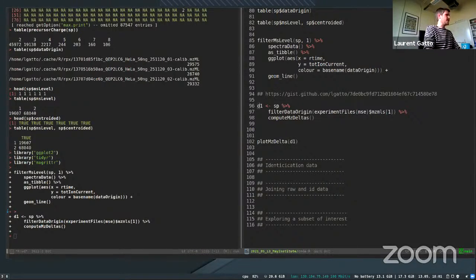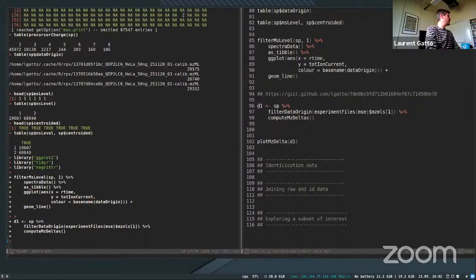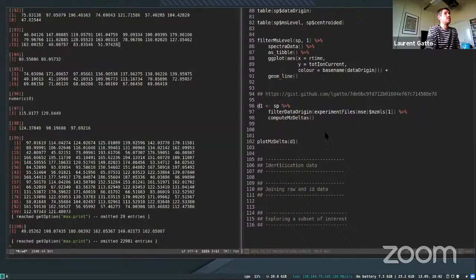And it looks like it's taking a lot of time, and I think that's because Zoom is taking quite a few resources. Let's see. Okay, let's give it a little bit more time. Here we go. And so if I look at D1 here, it's a list. And you see, this is a list with all the deltas between the fragment peaks of my MS2 spectrum.